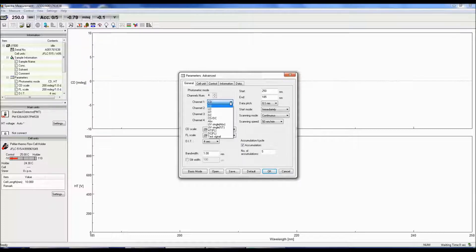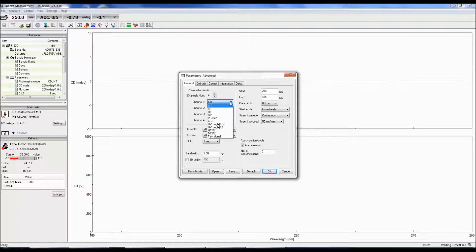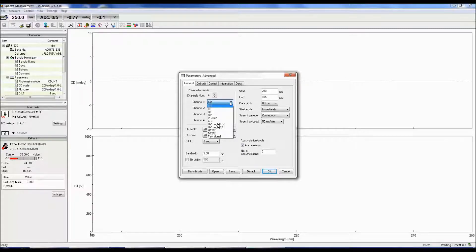The absorbance can also be calculated from the HT voltage while UV single converts the DC signal to either absorbance or percent transmittance.